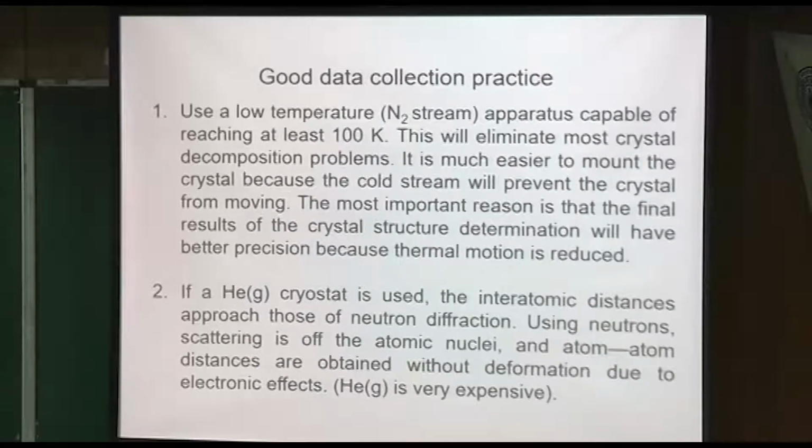Okay, so why do you do it? Because you eliminate decomposition. The only thing I've seen decompose really badly was a silver compound, because it's so light sensitive and the X-rays are pretty bright. And you can have decomposition of your compound, even at low temperature, if the light is too strong with silver compounds.